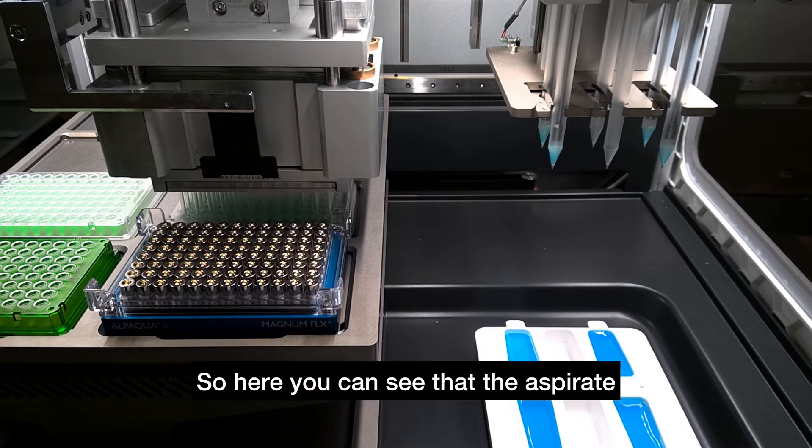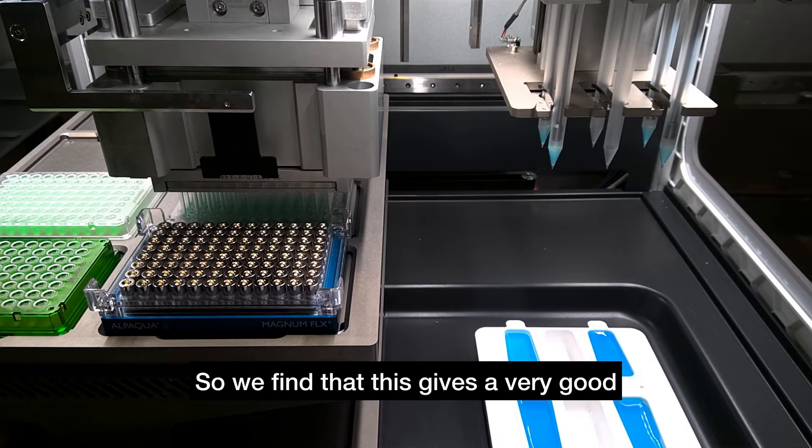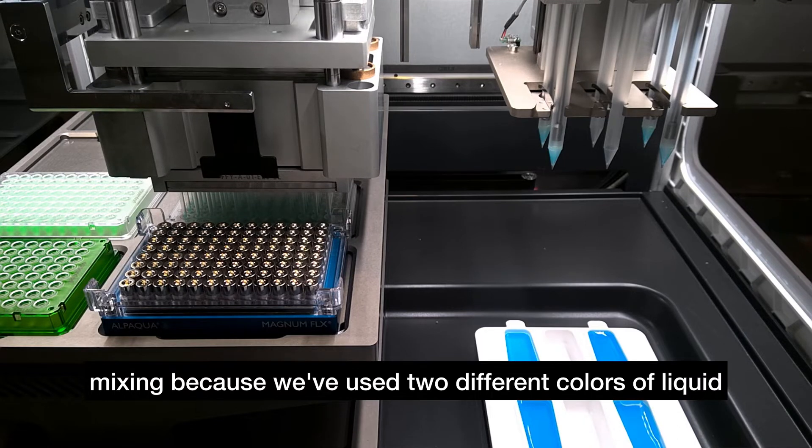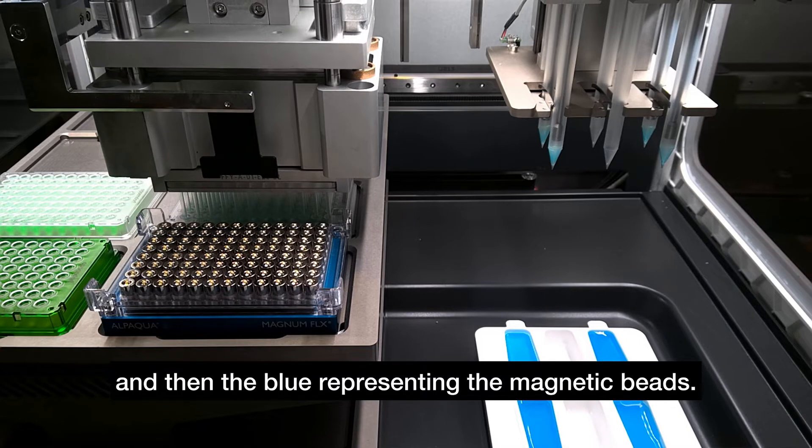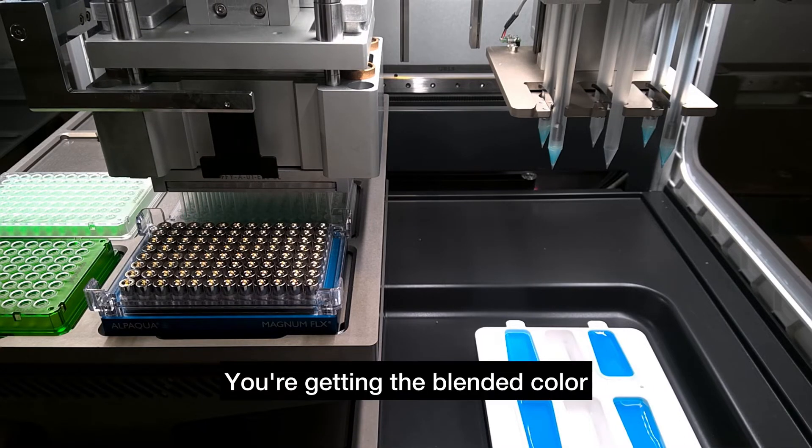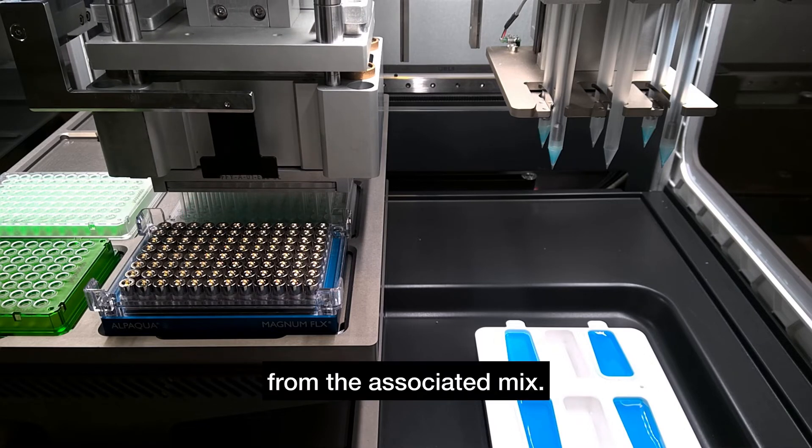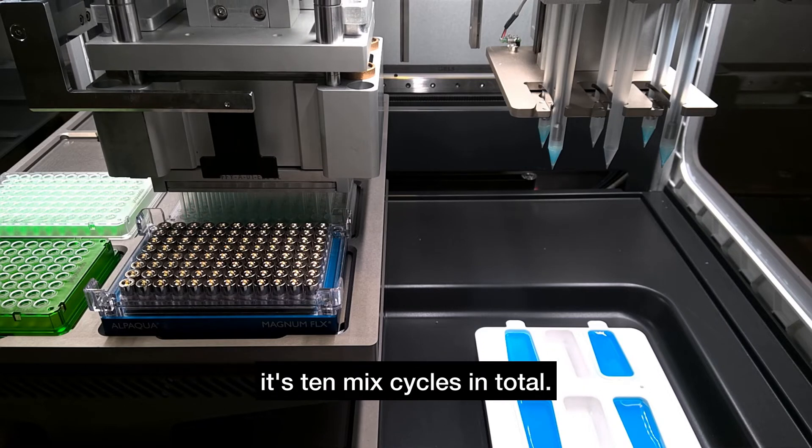So here you can see that the aspirate is low and the dispense is high. So we find that this gives a very good mixing because we've used two different colors of liquid here, starting with the green to represent the samples and then the blue representing the magnetic beads. You're getting the blended color from the associated mix. So it's just going to go through, I think it's 10 mix cycles in total.